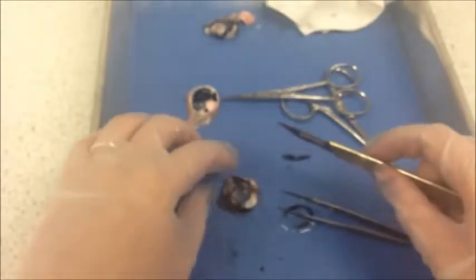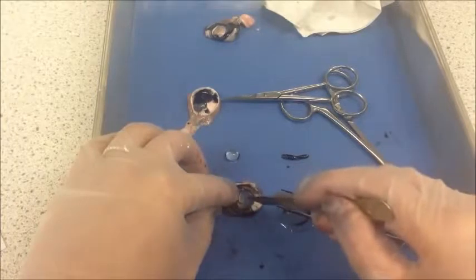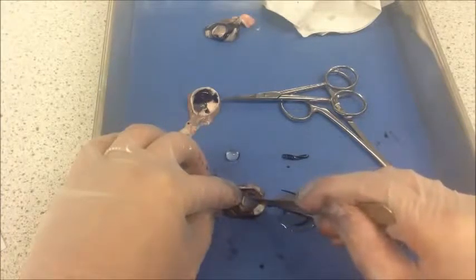If you poke the scalpel through the cornea, you can hear the crunch. This is because the cornea is very thick and protects the front of the eye.